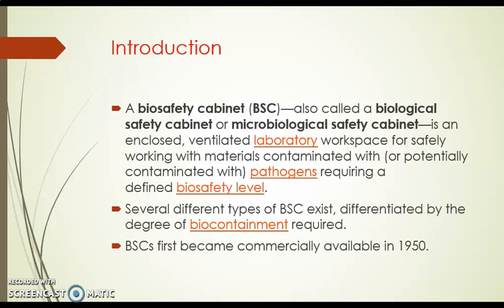Several different types of BSC exist, which are differentiated by the degree of biocontainment required. And these biological safety cabinets first became commercially available in 1950.